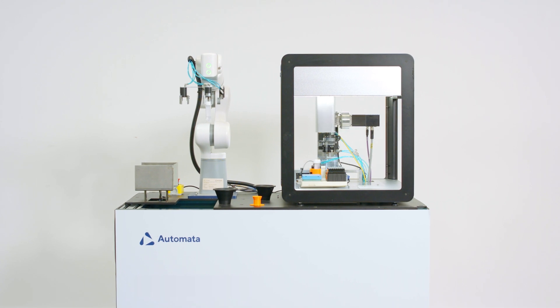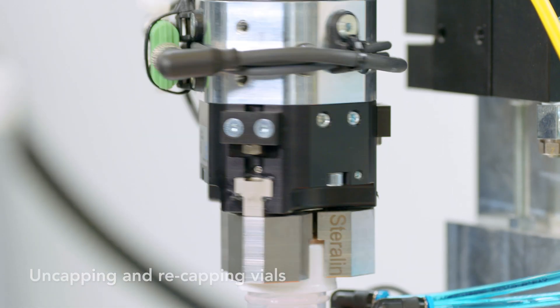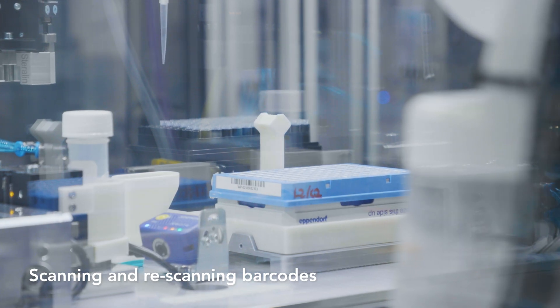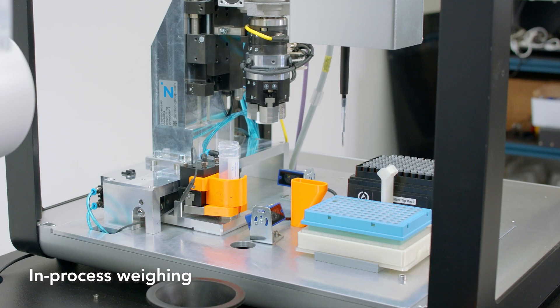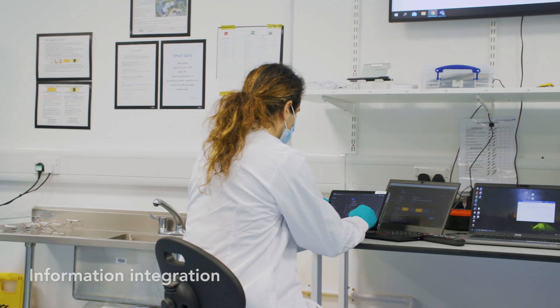Some of the things that Automata can automate are uncapping and recapping of vials, scanning and re-scanning of barcodes, in-process weighing of the liquid handling process, and information integration for LIMS systems.